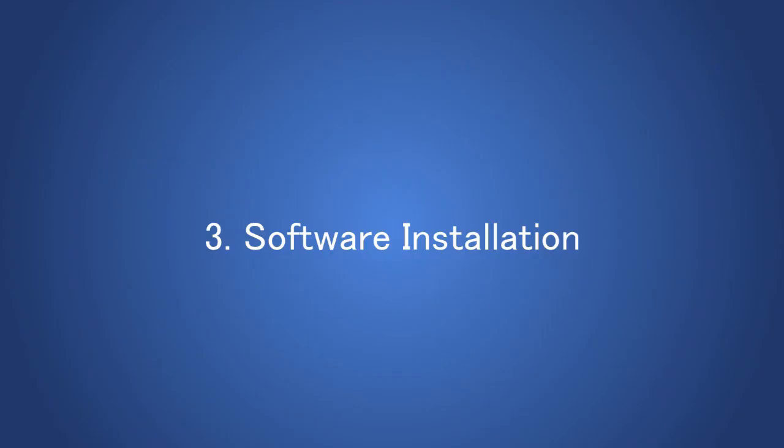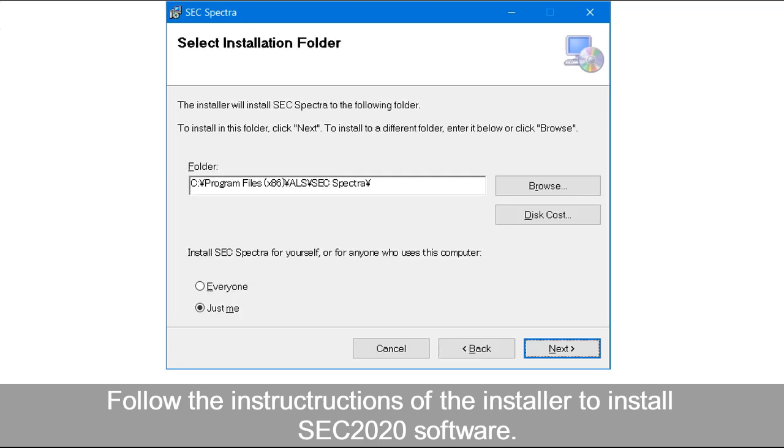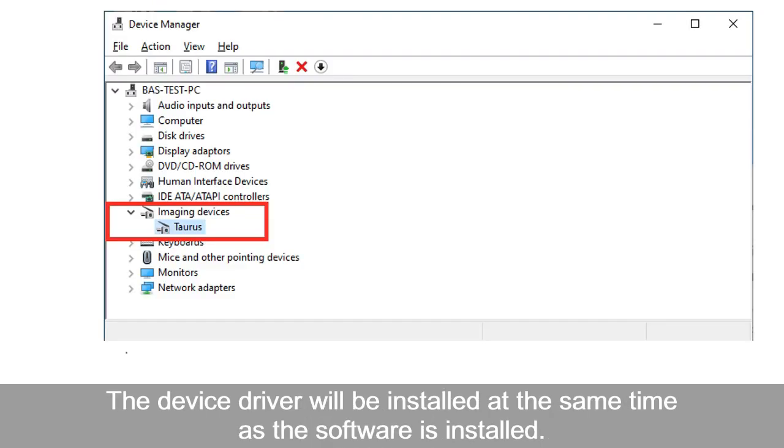For the software installation, connect the USB memory with the software to the PC and select the setup file. Follow the instructions of the installer to install the SEC 2020 software. The device driver will be installed at the same time as the software.